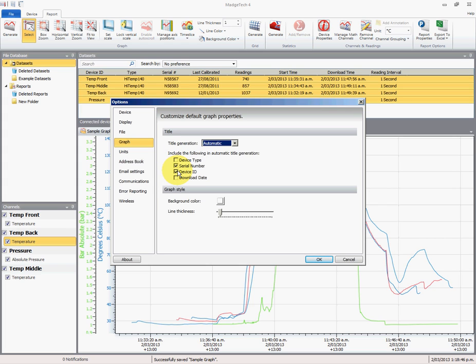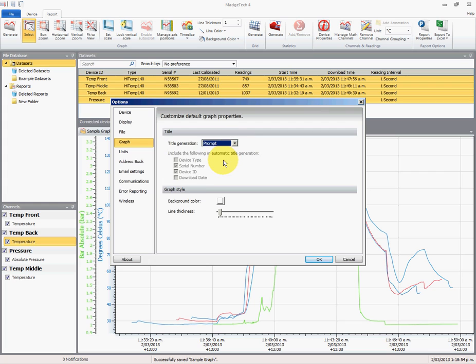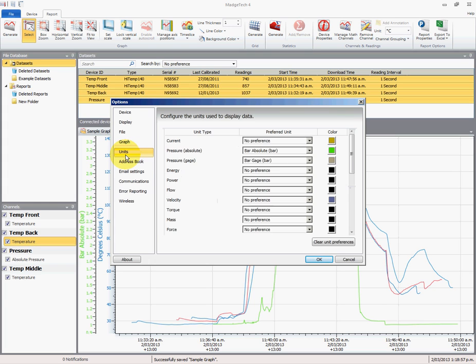In this instance, I'm just going to go prompt because it just makes it a bit easier for me to work with the units.